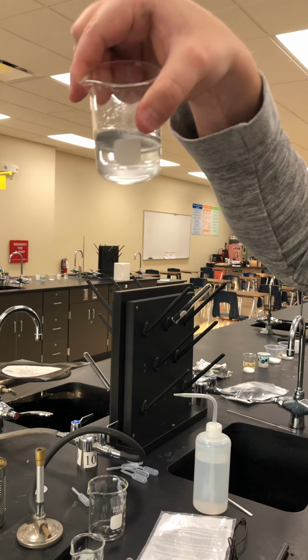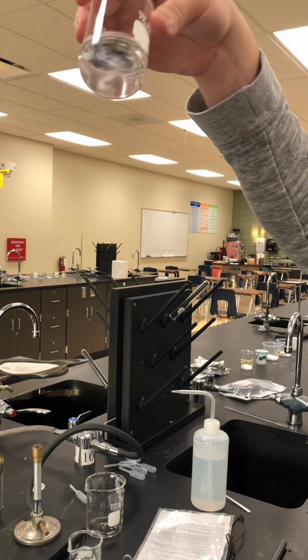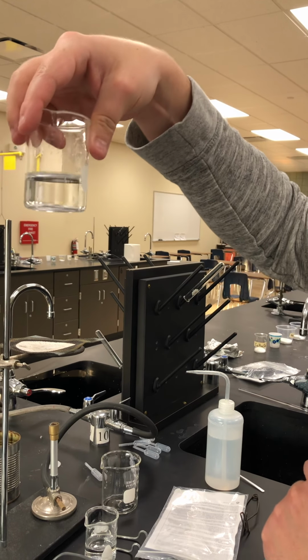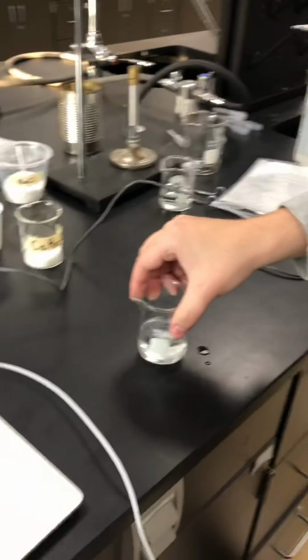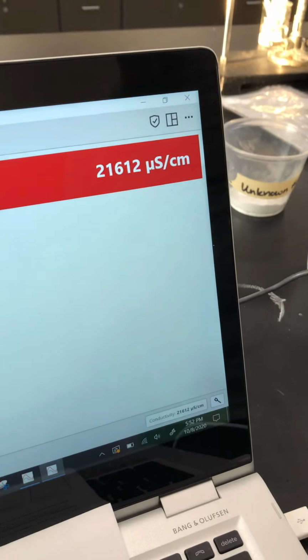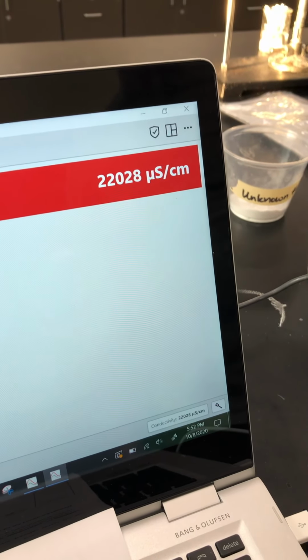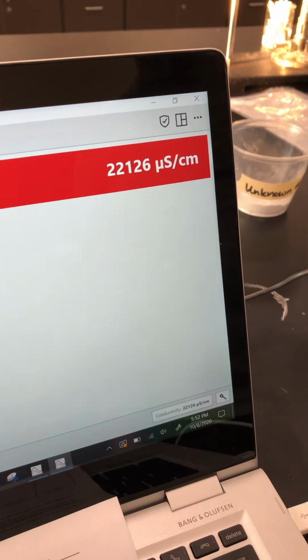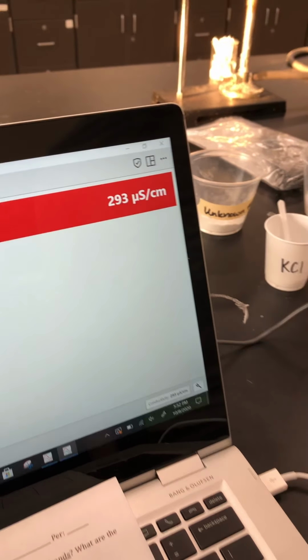And it's a little bit cloudy, but there's definitely not a lot on the bottom. So I think this one dissolved as well. So now we can test conductivity. So this one's 22,000 about. So that was unknown 1.